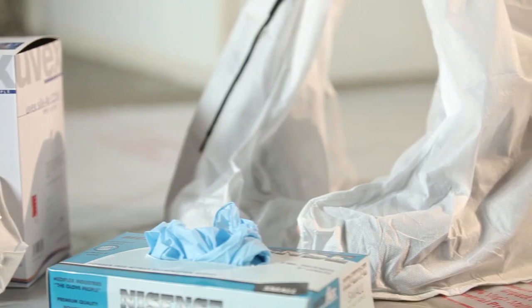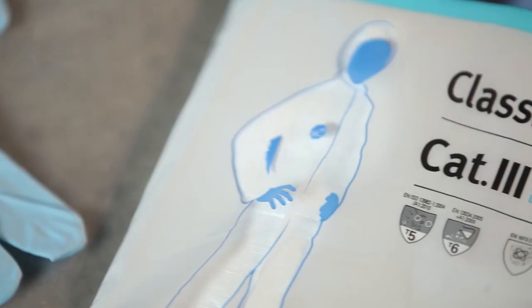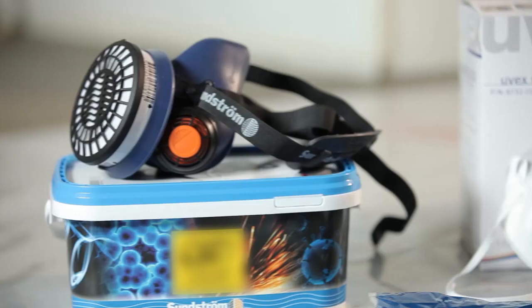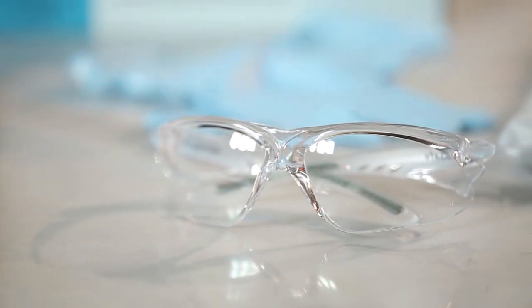Completing a risk assessment will help you choose the right PPE for the task. It will determine whether you need to wear items such as boot covers, disposable coveralls with a hood, a respirator, eye protection or a face shield and gloves.